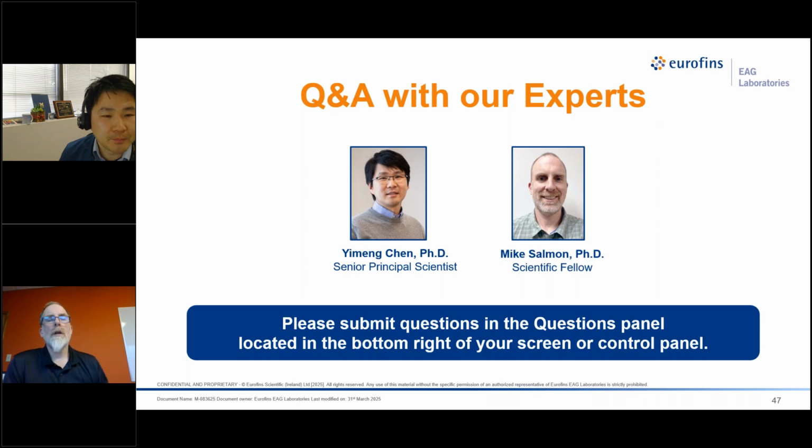Yeah. So one last question here is, are there any memory effects in terms of matrix contamination? I think this might be related to SIMS measurements. So is there a difference in the directionality of doing the APT experiment in terms of driving some constituent in, like we see with SIMS, or is APT fairly free of this artifact?